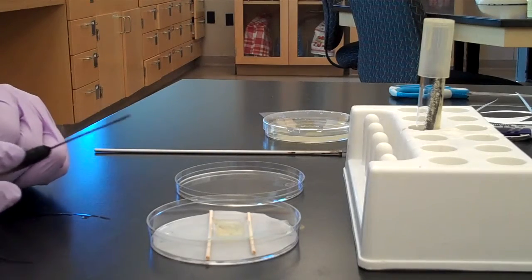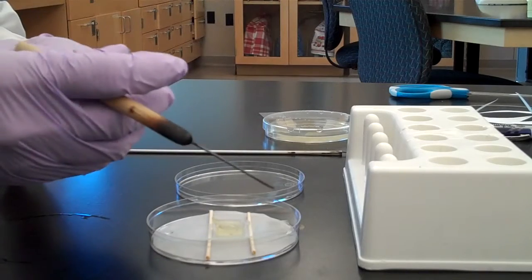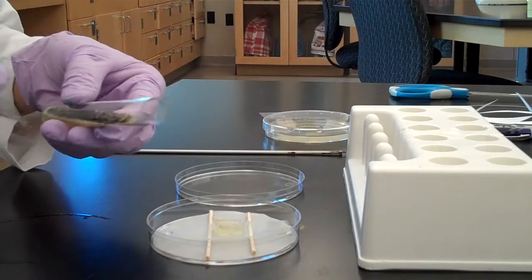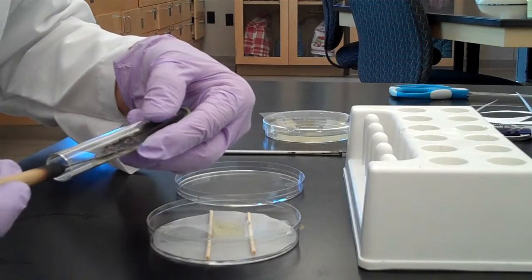Using a sterilized dissecting needle, pick up some spores by scraping the needle just inside the outer edge of the mold colony.